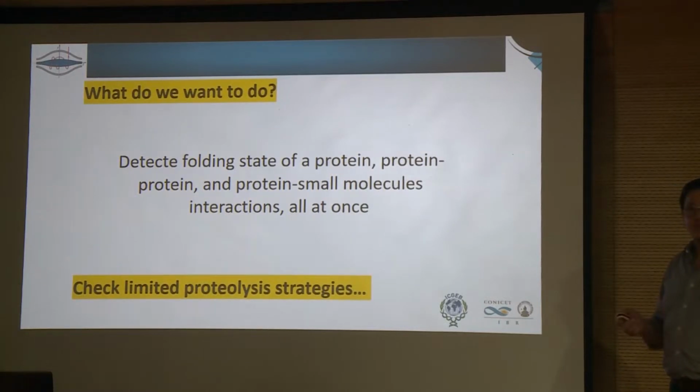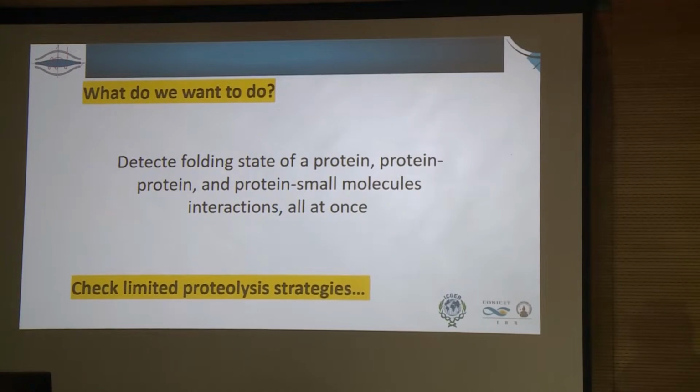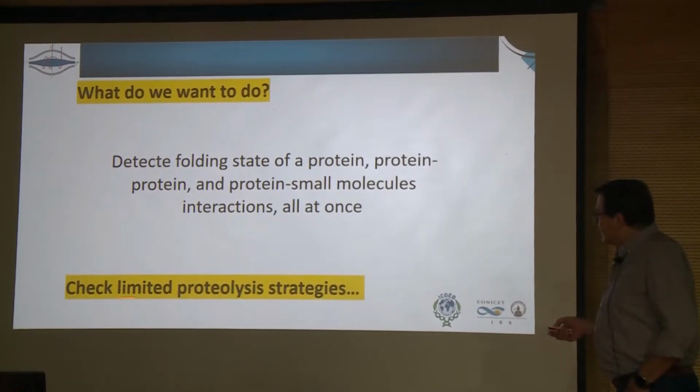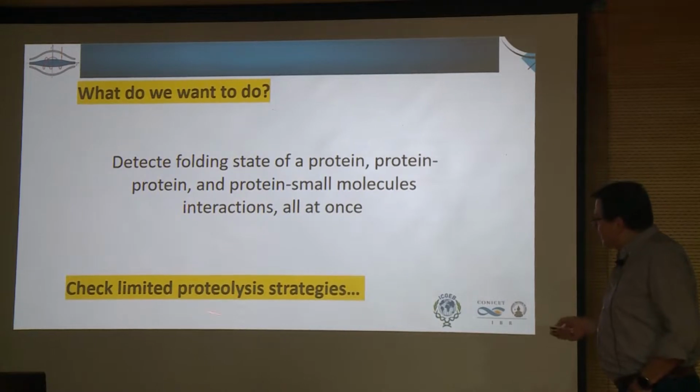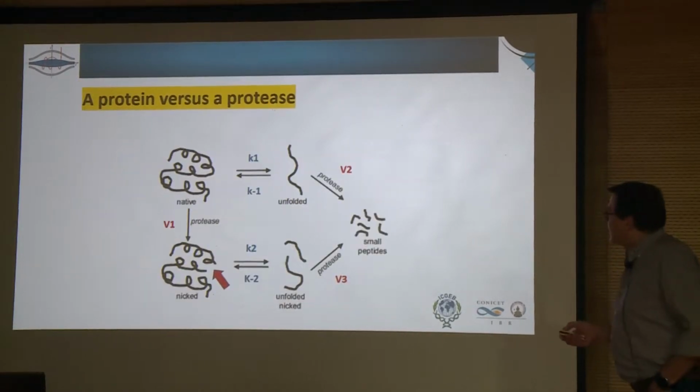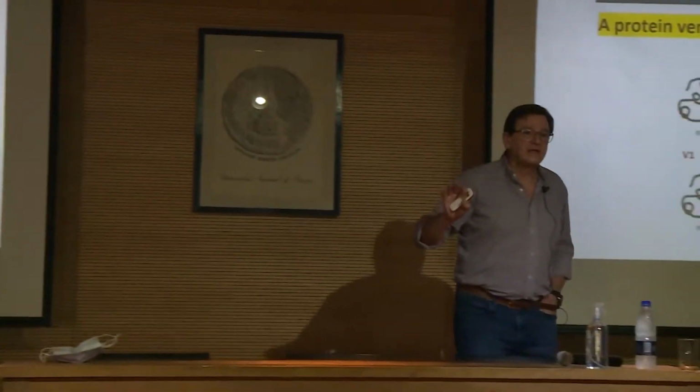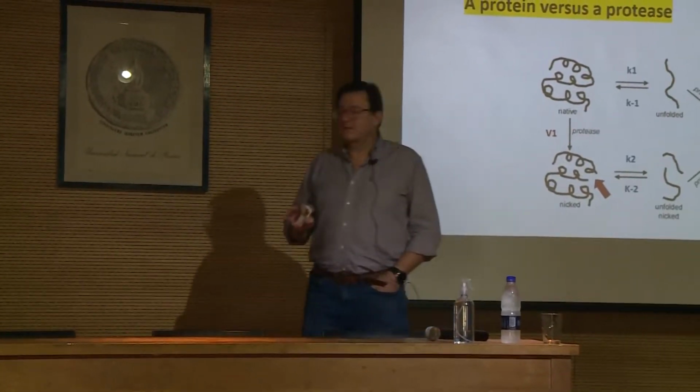That's kind of a great task. So check limited proteolysis to do that. I will go through some kind of biophysical basic aspects.